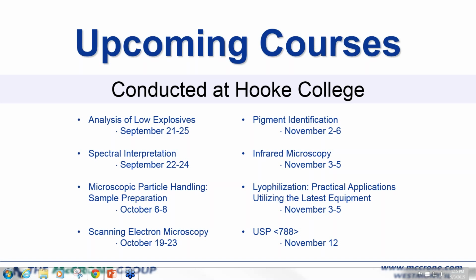Let's see, what else do we have from Kimberly? Do you have a comparable ATR database? I believe there are some commercial ATR databases, and among our in-house libraries, we do have an ATR library as well. A lot of it is check with your instrument vendor, and they can supply you with the commercial libraries that are available that work with your software.